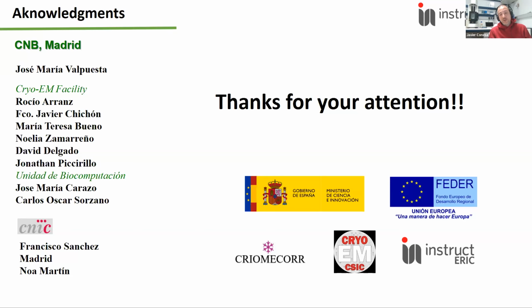Actually, no. We want to avoid ice contamination. So once the lamellas are prepared, we are not loading them again in the cryofluorescence microscope because we don't have a cryofluorescence microscope online in the cryo-FIB-SEM. But I mean, we can modify the pipeline. We can adapt to the user. So if the user wants to, after preparing the lamellas, load them in the cryofluorescence microscope, we are able to.